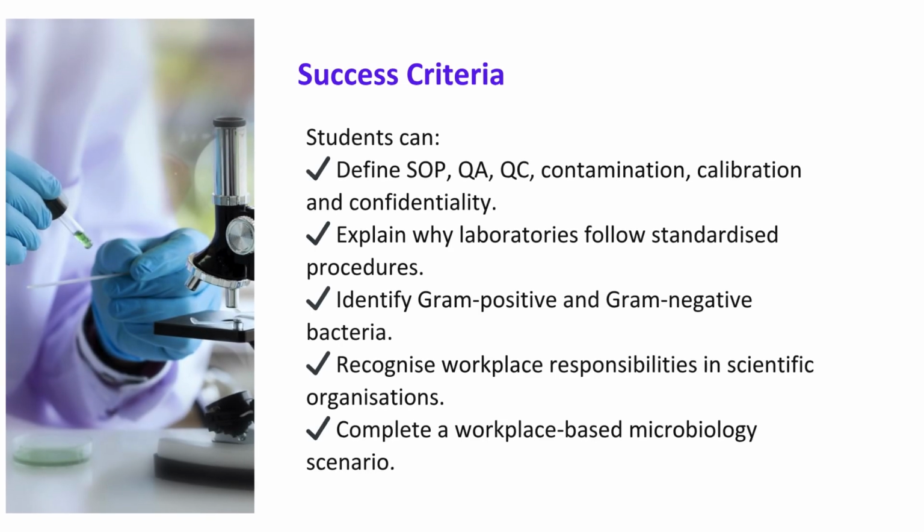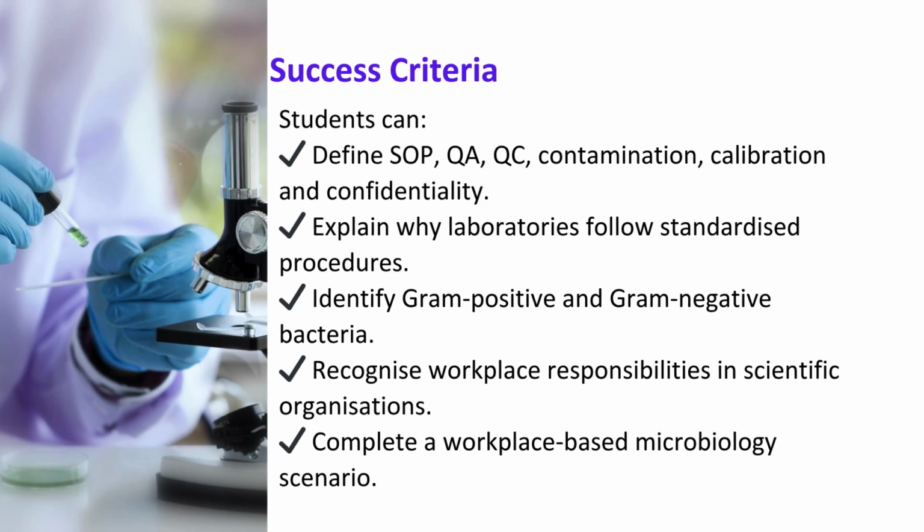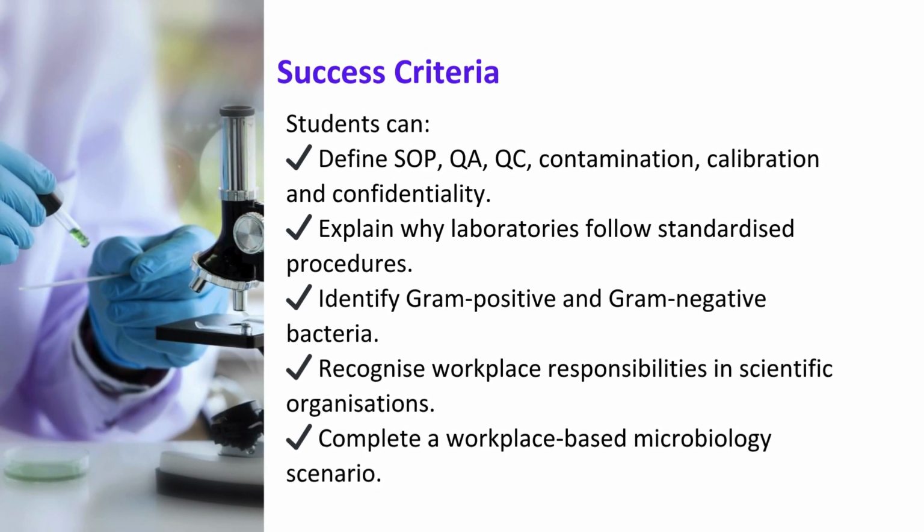To be successful in this lesson, you should be able to define key scientific terms such as SOP, quality assurance, quality control, contamination, calibration, and confidentiality. You should also be able to explain why laboratories follow standardized procedures, identify gram-positive and gram-negative bacteria, recognize workplace responsibilities in scientific organizations, and apply your knowledge to a real microbiology workplace scenario.